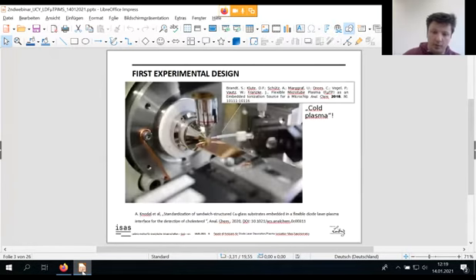This is basically the first setup that I got. It's still microscopic glass slides, the ones you can buy from Thermo Fisher and similar manufacturers, but it's coated with copper, so it's like a sandwich structure. You have a thin copper layer and a thicker glass layer below, and this was really the key element in the desorption, as you will see in a few minutes.